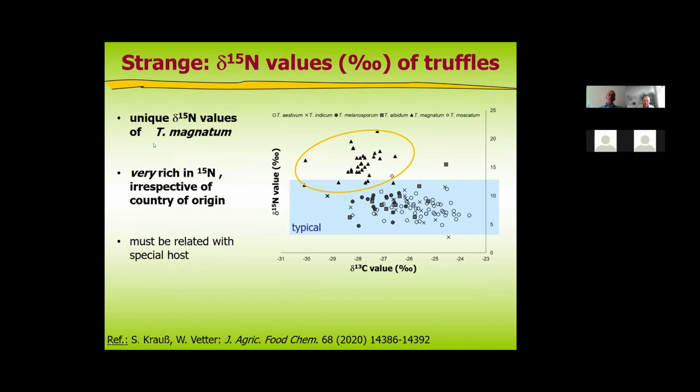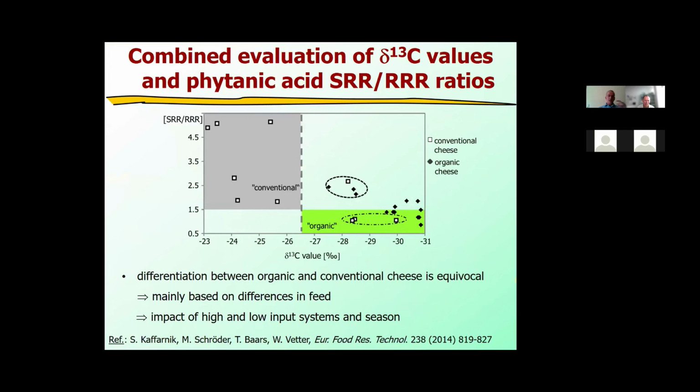And the interesting thing is that the magnatum is one of the 2 very expensive and very special truffles. So this is a very, very good marker where you can check it. But of course, at this point, we have to find out what is the reason for that.